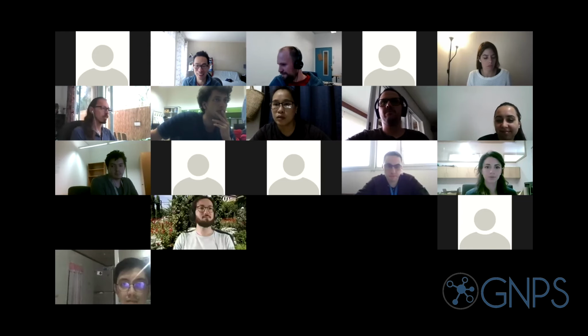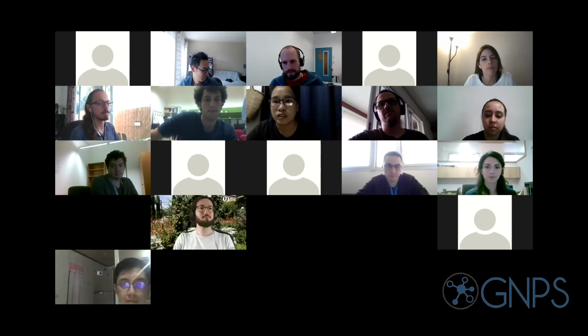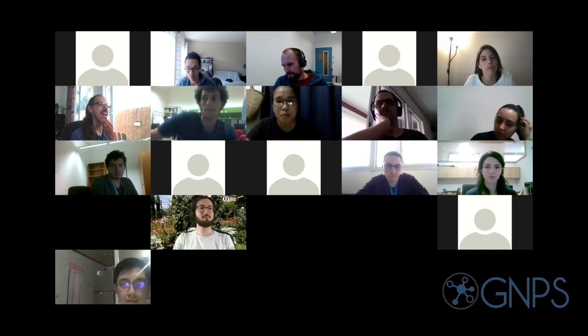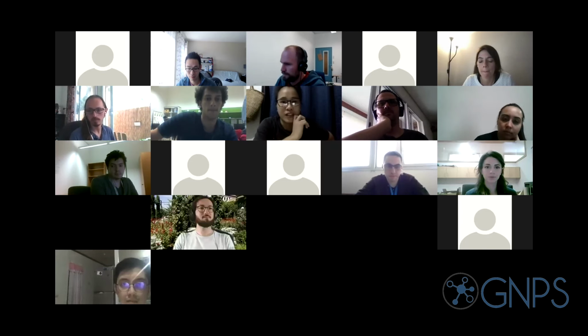Is Louis still here on the chat? Because Sydney asked about the bioactivity-based molecular networking method. So basically, can we request an easier alternative aside from R to compute the correlation p-values for the feature-based molecular networking profile? Basically, correlate bioactivity with features that are observed by mass spec, which is the hallmark of bioactivity-based molecular networking. And right now it's just an R script, and we don't have a systematic way of doing it in GNPS yet.